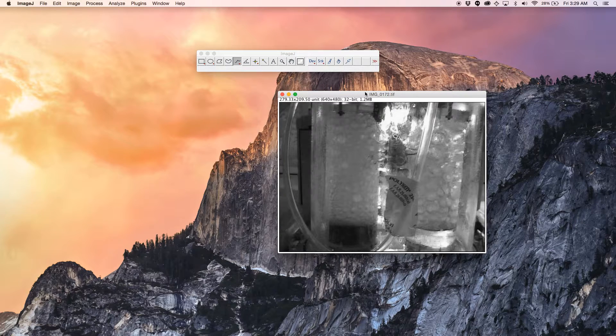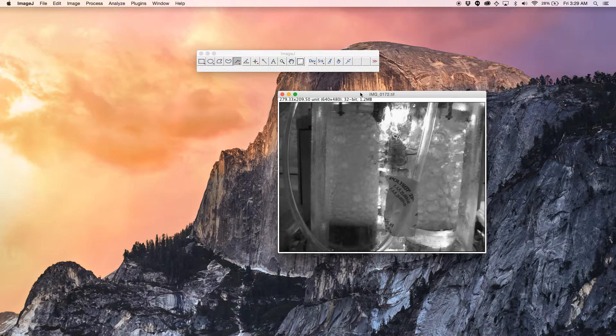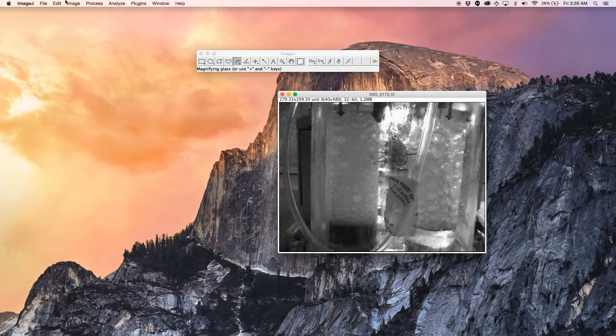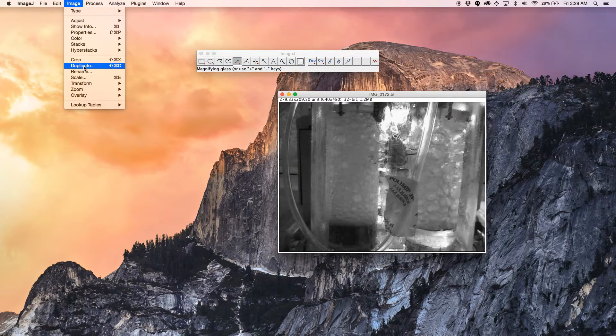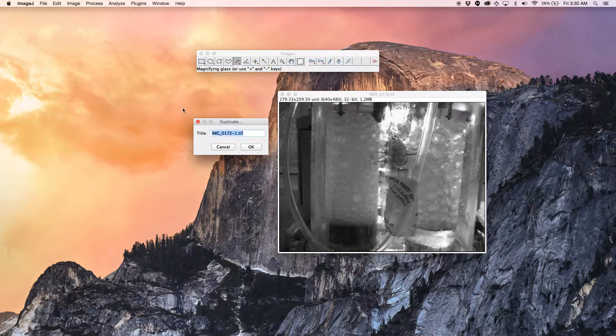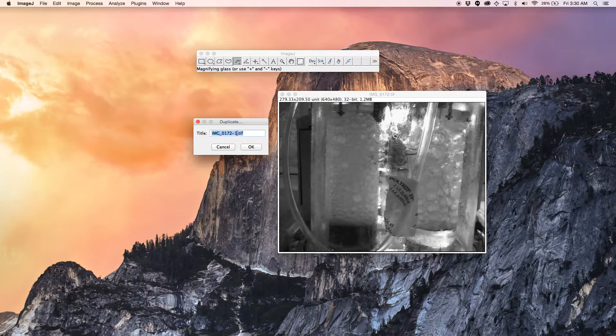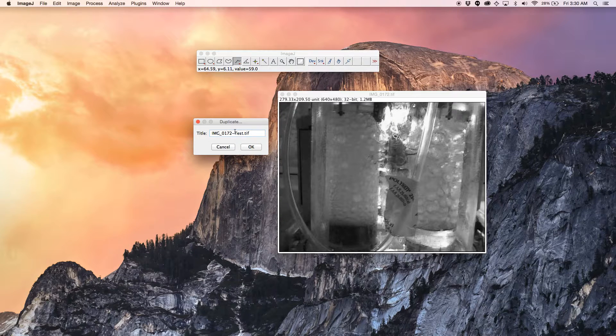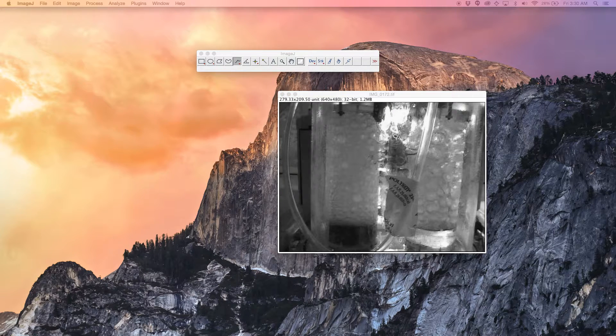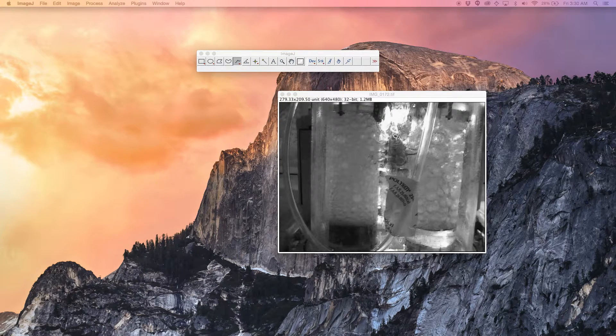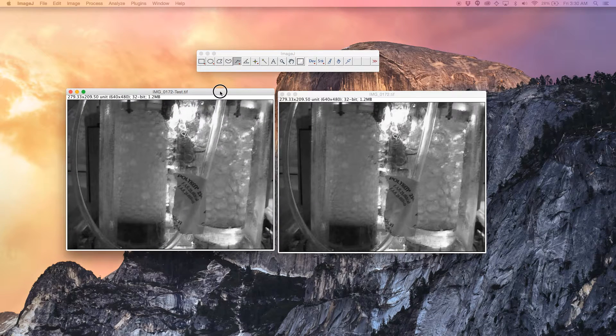The best thing to do is first make a duplicate copy of the image you're working on. Just click here and duplicate. I'll give it the name test. Click OK. This will create another image. Actually it's down here.